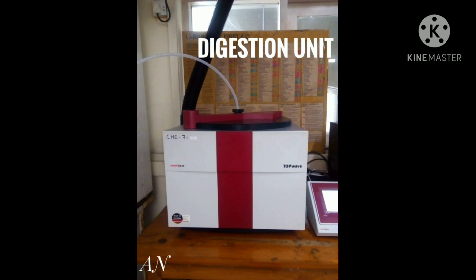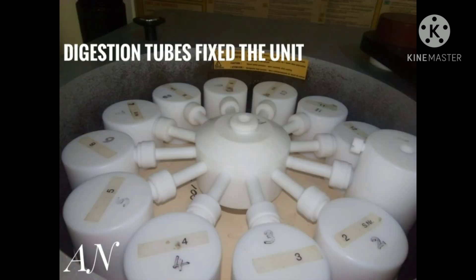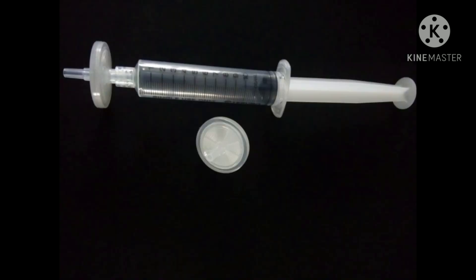The fifth step is the tubes were transferred to the digestion unit and the program was set. The sixth step is after digestion, the tubes were removed from the unit. The seventh step is one milliliter of the digested sample was transferred to the sampling tubes using a filter-connected syringe.